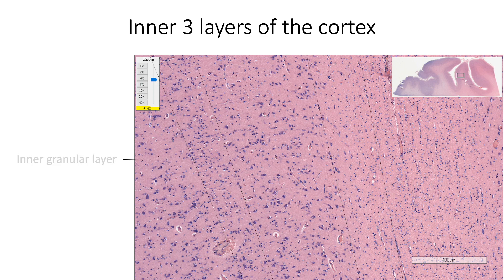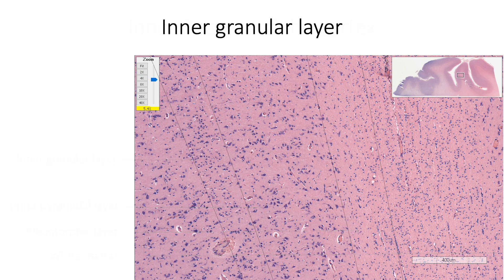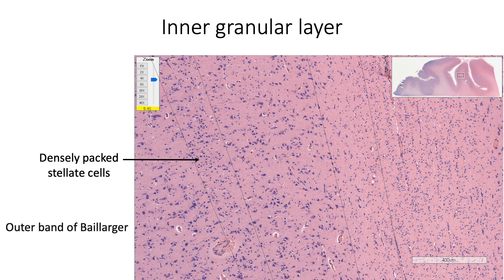The inner three layers of cortex include the inner granular layer, inner pyramidal layer, and pleomorphic layer, and innermost to these layers of cortex we find the white matter. The inner granular layer consists of densely packed stellate cells, along with the outer band of Baillarger.